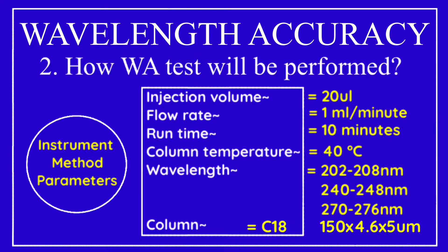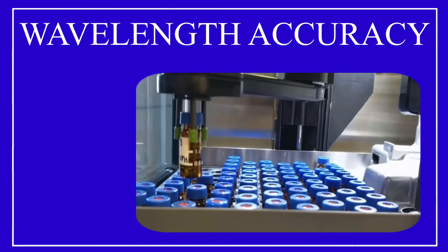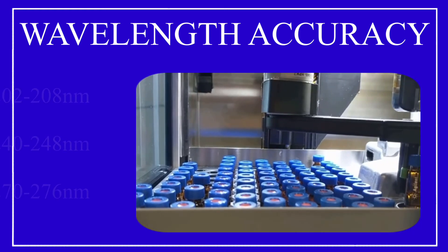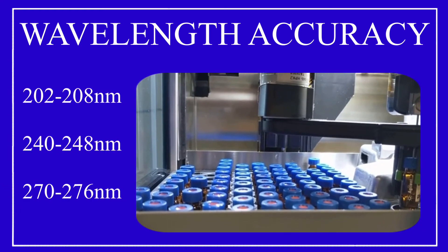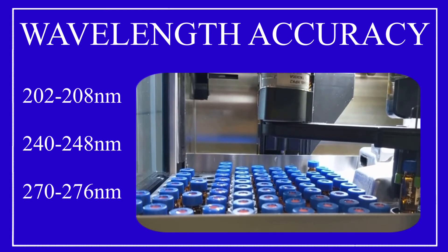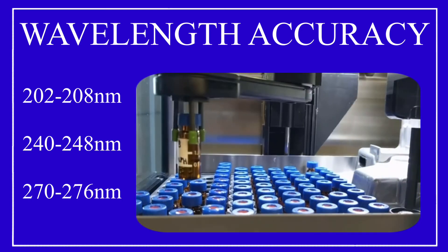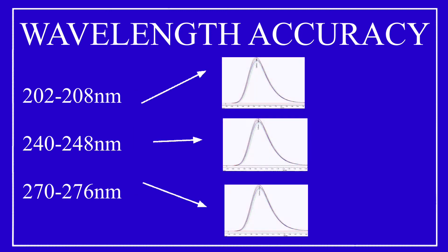After applying these instrument method parameters, the HPLC is equilibrated with mobile phase. Once the HPLC system is stabilized, the 25 ppm caffeine standard solution is injected into the HPLC system using these three different sets of wavelengths. The data generated from these three different wavelength sets is then evaluated to check whether the wavelength accuracy test is passed or failed.